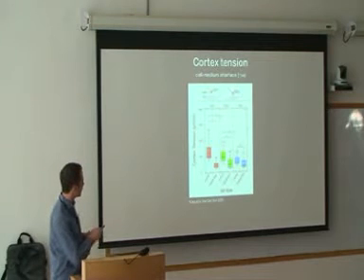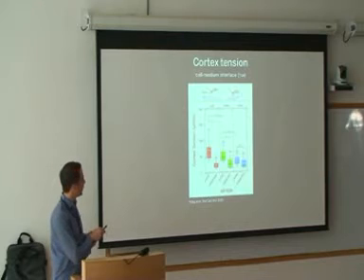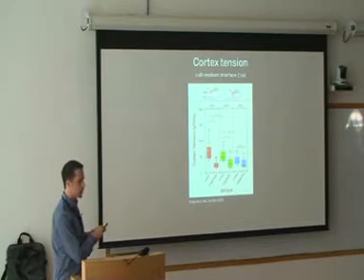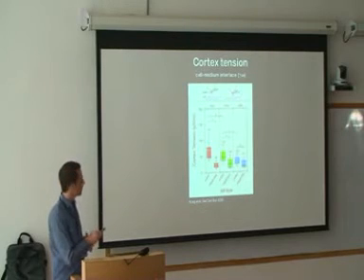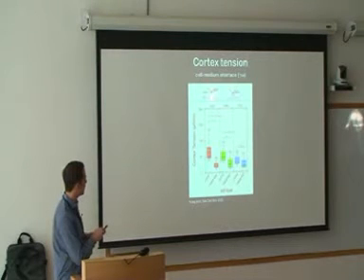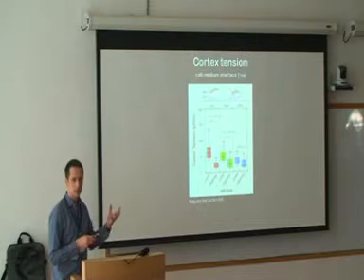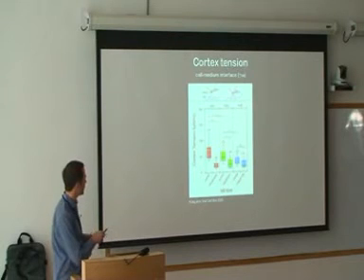Now, what we're doing in this experiment here is we're using an atomic force microscope. It has a cantilever. There's a laser which is reflected by the cantilever. We put a plastic bead on the tip of the cantilever. We glue it on the tip of the cantilever. We're putting a cell on a substrate. The substrate doesn't have to be adhesive. This is a single progenitor cell. And basically, it forms a cortex which is at the interface to the medium, because it's a single cell not in contact to another cell.